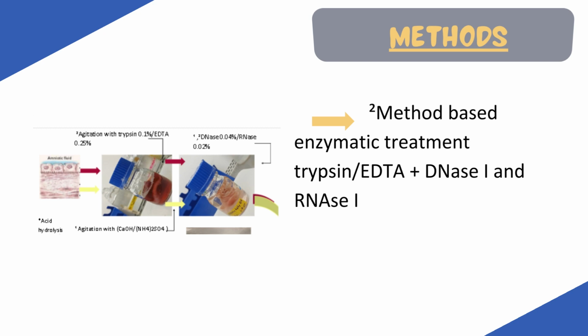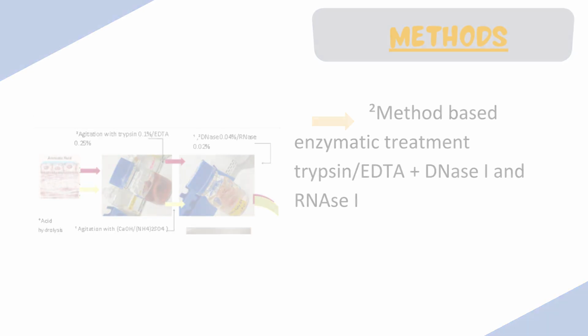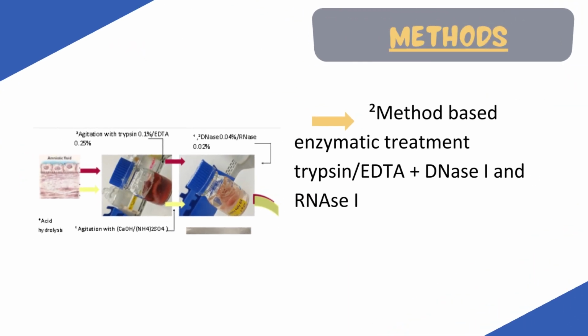To evaluate the effectiveness of decellularization, the amount of residual DNA was measured for each method and compared. Likewise, the amount of sulfated glycosaminoglycans was evaluated in order to assess the loss of this marker of bioactivity components.